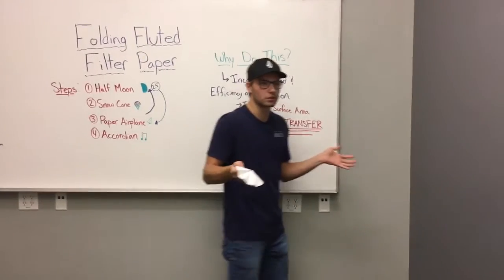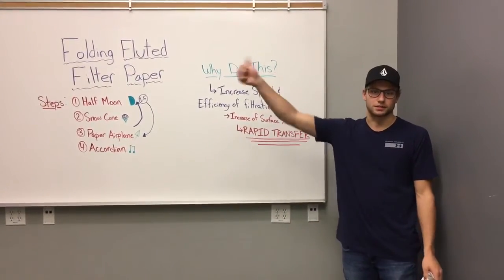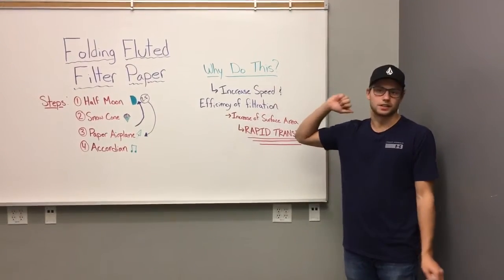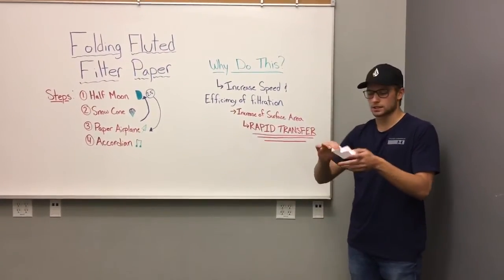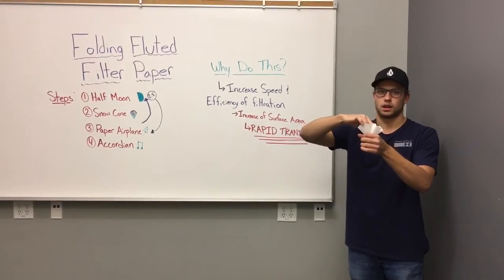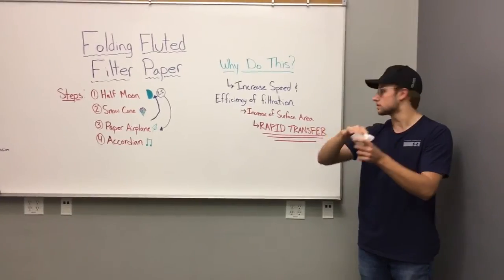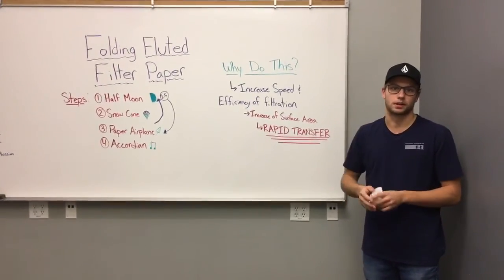And you might be asking, why would we flute our filter paper? Two things: increase efficiency and increase the speed of our filtration. It does this by increasing the surface area when you put it in the funnel. We do this for a rapid transfer of our solution through the filter paper.